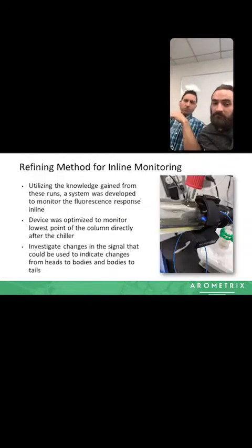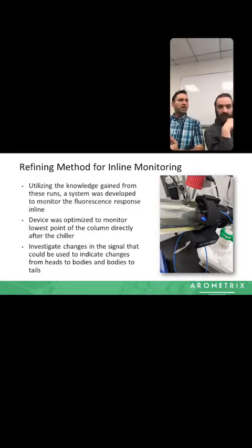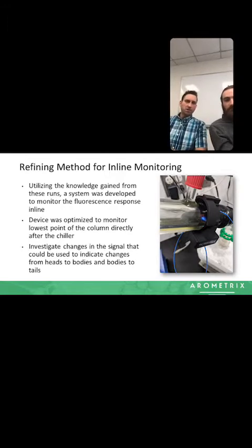That's right. So the information we got from the EEMs told us that yes, fluorescence was interesting, and told us where to look. We did the benchtop systems that told us yes, we can see differences. It's not always looking the same no matter what happens. And now we have the HPLC, which is telling us that yeah, we see the differences between compounds.